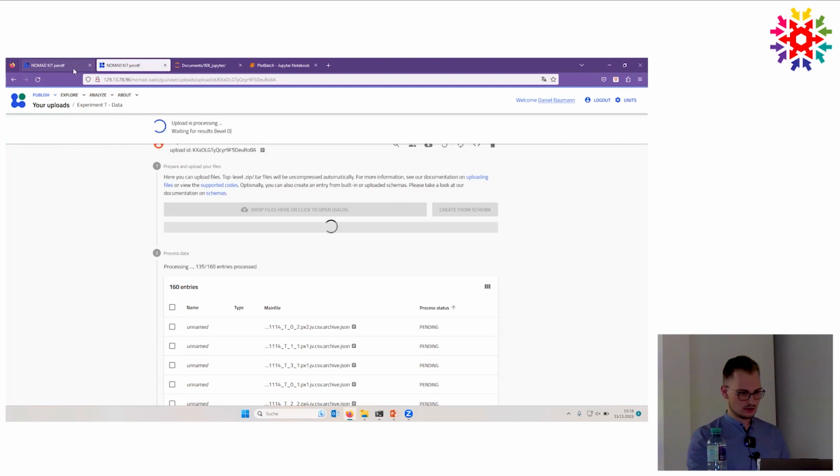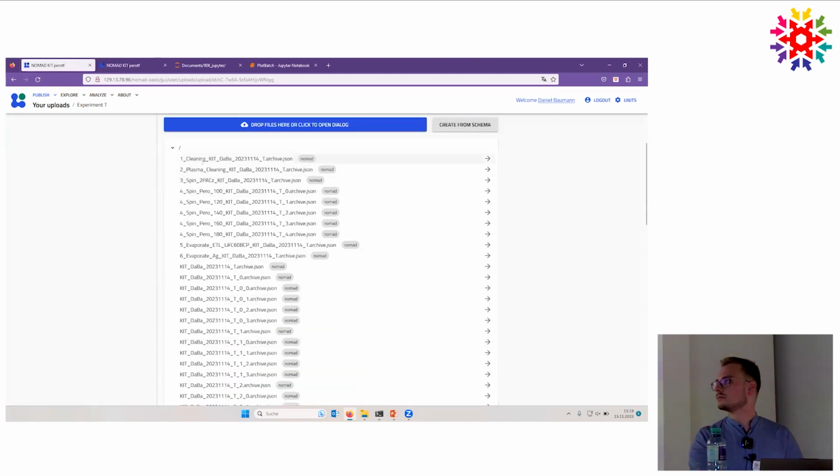We can look into these: the first processes are created, or they inherit some functions from base classes. And Micha has helped us a lot with setting this up. This enables me then to just plan the experiment in this experimental plan, which took maybe 5 minutes, and then we can work with this.